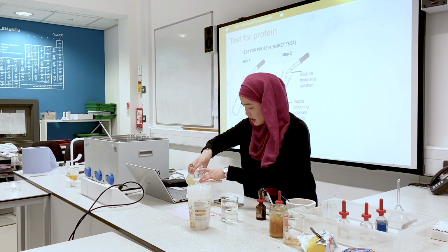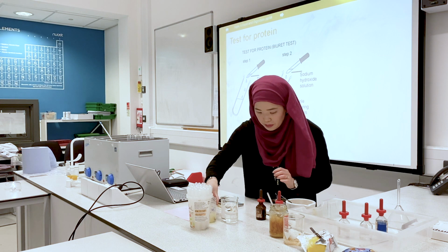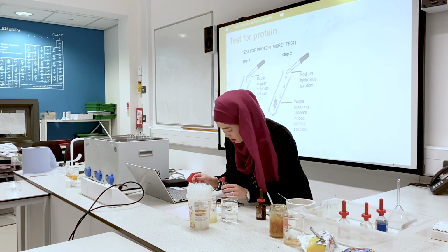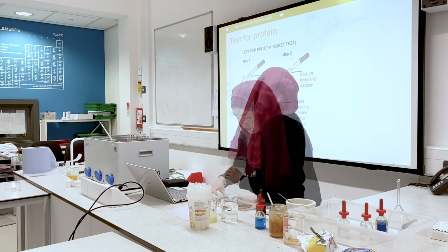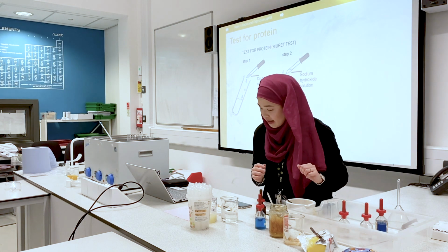And egg. Oh, I forgot to add sodium hydroxide.